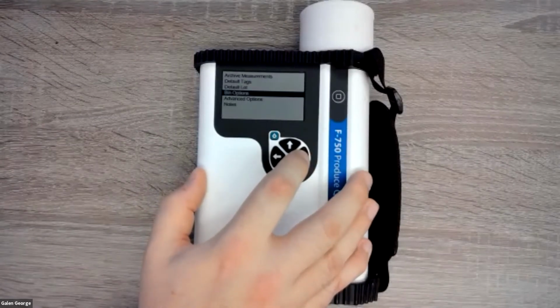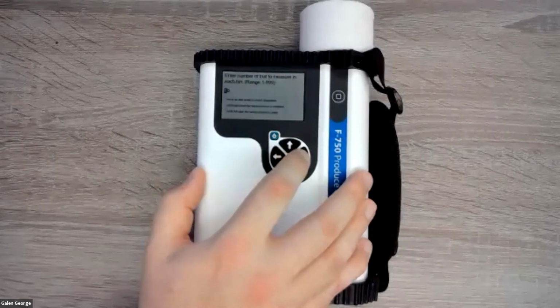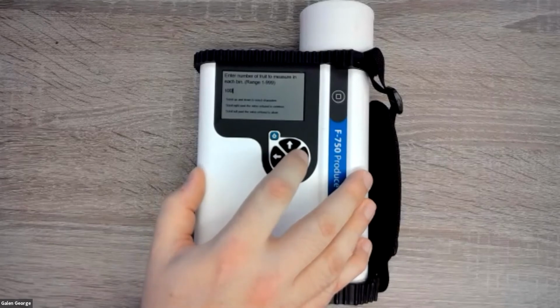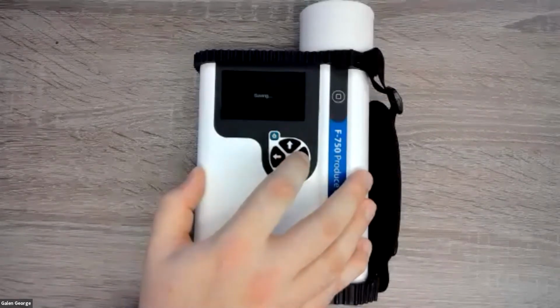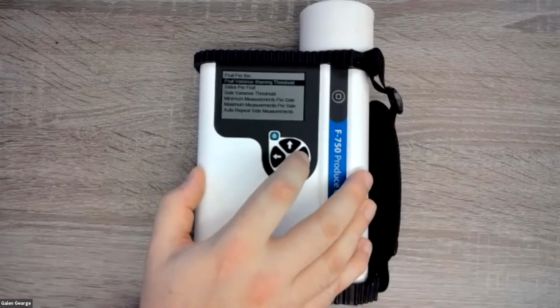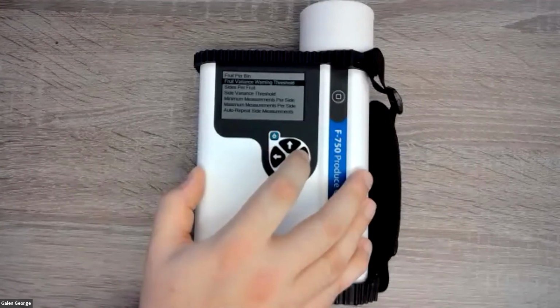The bin options, this is what we're most excited about. If I click right on bin options, this is where you can change things like, as I mentioned, there was 10 fruit per bin. I can change this number to be 100 fruit per bin. I click the right arrow and save it, and when we go back to the measurement screen, you'll see what the changes were. There's also a fruit variance warning threshold. As I mentioned, we have the standard deviation that is being automatically calculated now.